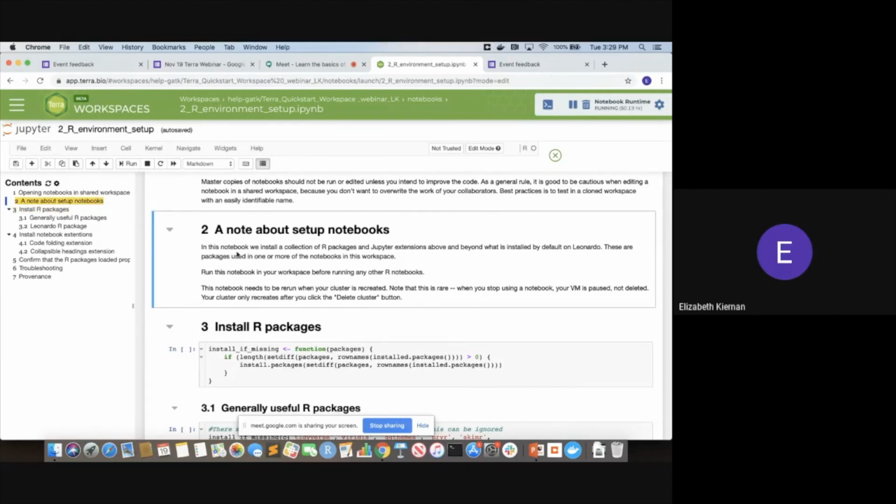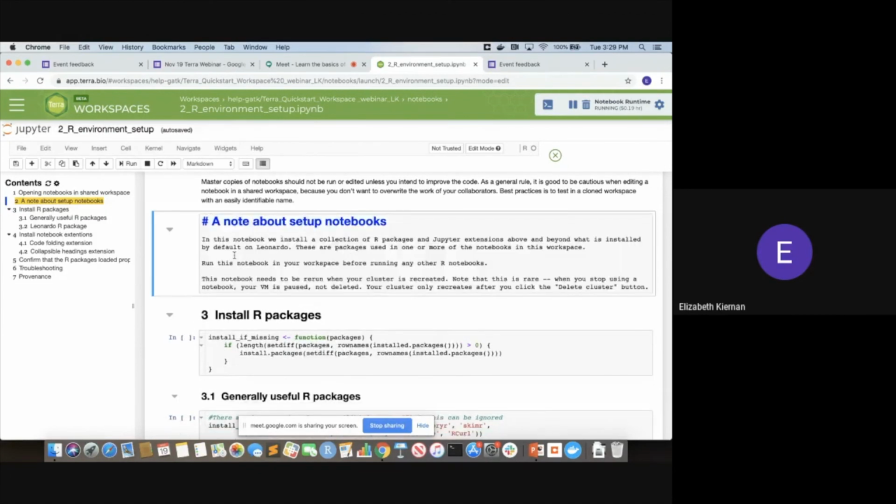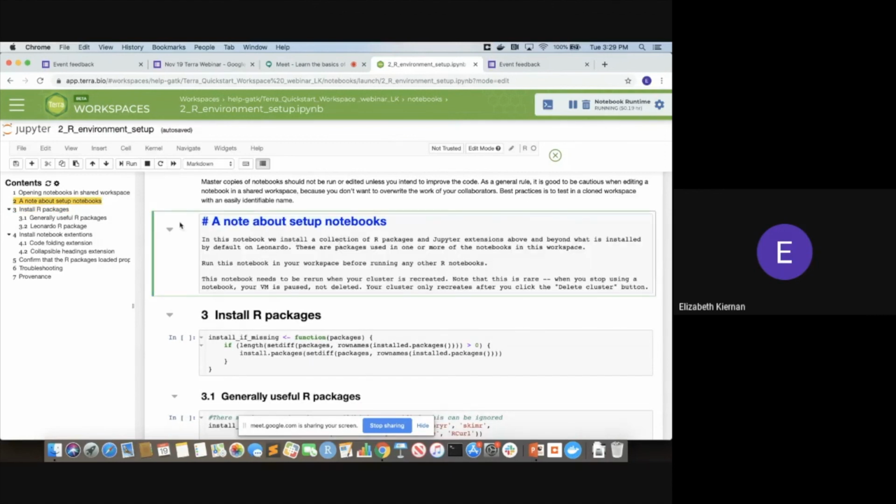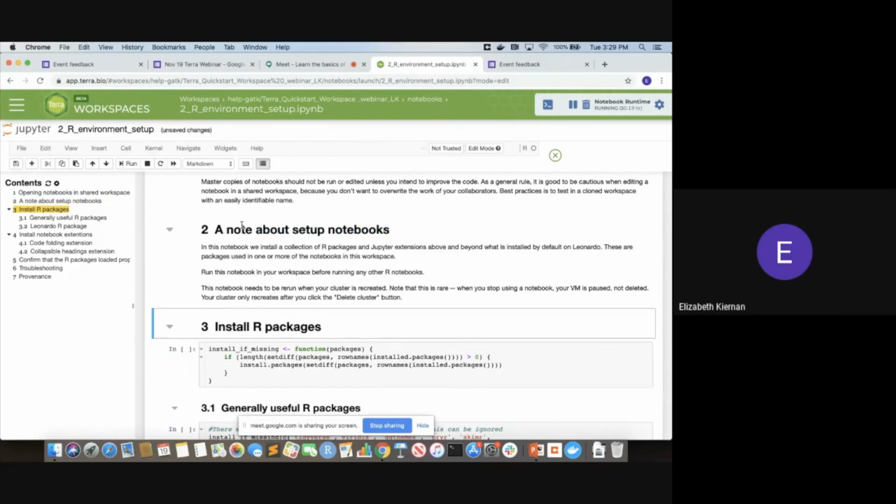If it is a markdown cell, you have to double-click it to get into the edit mode. And then when you run it, it parses that markdown script and turns it into the nicely formatted markdown cell that it should be. Another very popular way to run a cell is the shift-return hotkey, which I will be using especially in the next notebook.